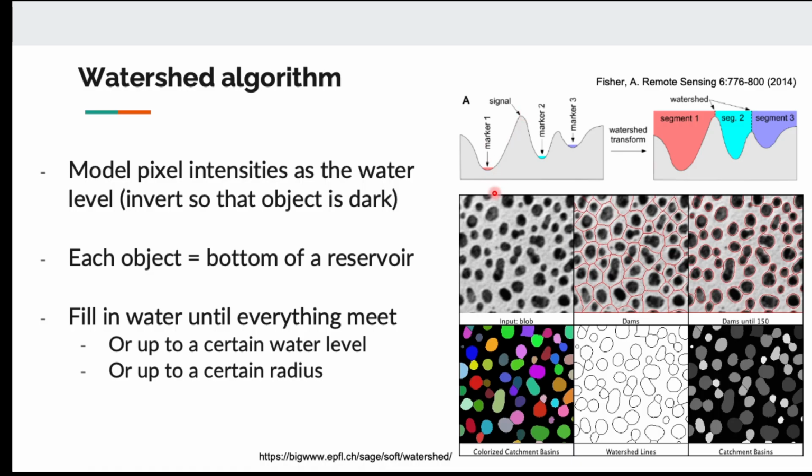So in this case, each nucleus that we detect will serve as, let's say, a water reservoir, like a lake, for example. If you pour water into this map, it's going to fill the hole first. And if we put individual nuclei with different colors, water that goes into nuclei number 1, let's say they are red. Water that goes into nuclei number 2, let's say they are blue.